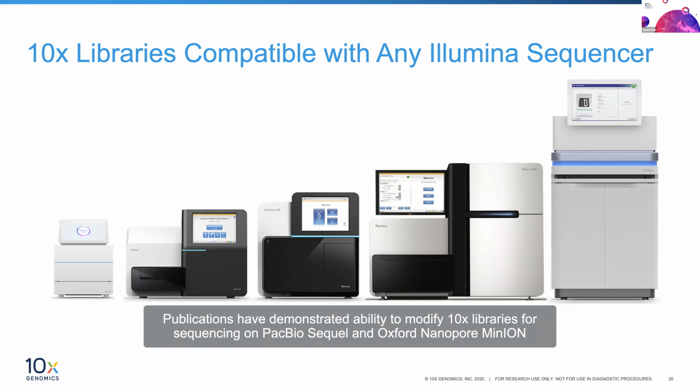But I mentioned powerful bioinformatic tools that are being built to take that previously spatially naive single cell sequencing data and use spatial transcriptomic information as a gene signature scaffold to try reconstructing that single cell data back into physical 3D form. I think about it like doing paper mache with sequencing reads, right? So you use the spatial information first as the wireframe, and then you take your single cell data as the pieces of paper mache that you're trying to reconstruct.